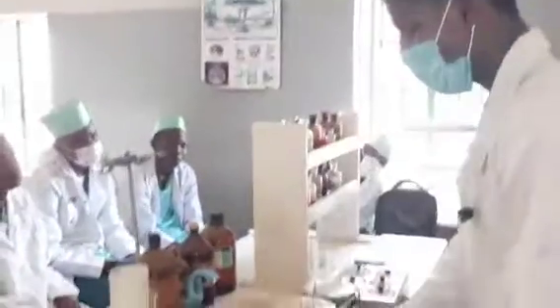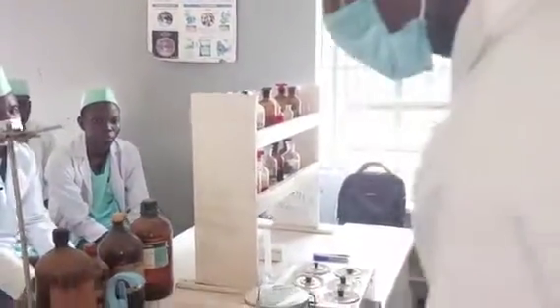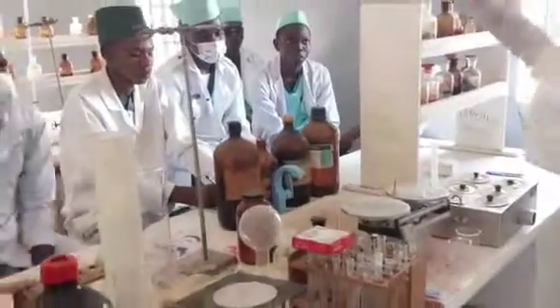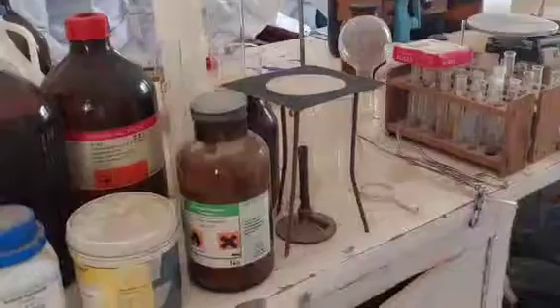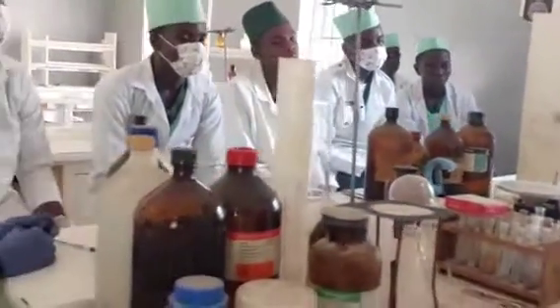A wire gauze goes on it. We have our Bunsen burner. So this is used in the case of heating, if the reactants are not flammable. Is that understood? So whensoever you want to do analysis, all these factors need to be considered.